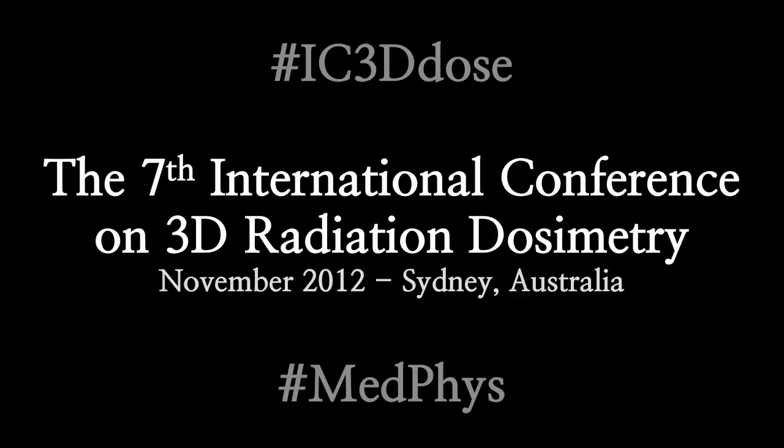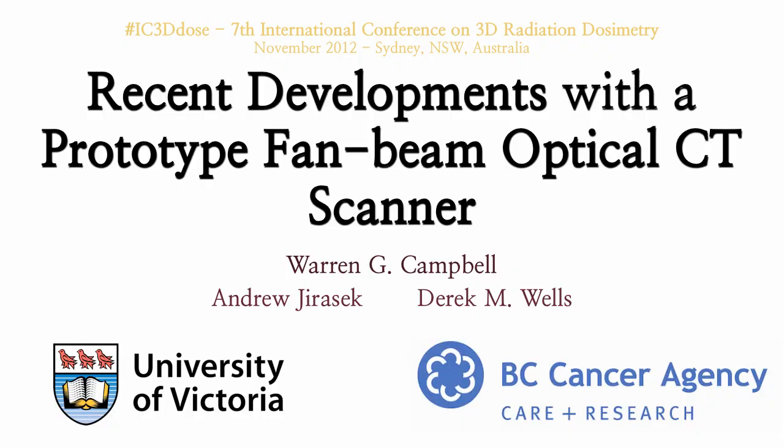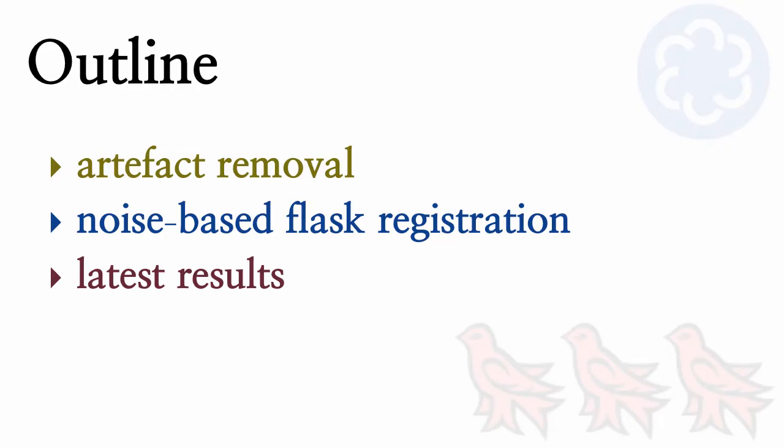presented. Hello, my name is Warren Campbell, and I'm currently working with a prototype fan beam optical CT scanner. And in my talk today, I want to highlight some developments that have taken place with the scanner since the last conference in South Carolina. I'll start off with some artifact removal techniques. I'll introduce a noise-based flask registration technique, and I'll finish off with some of our latest results.